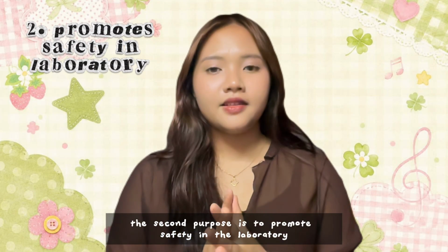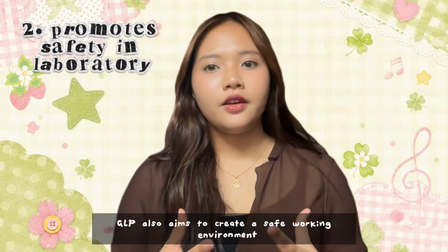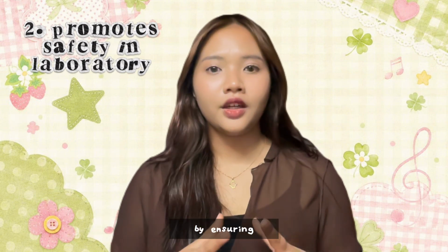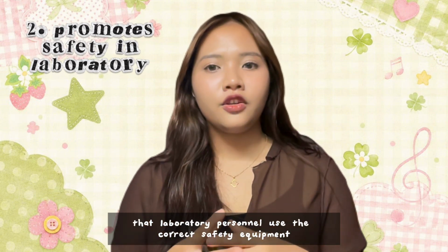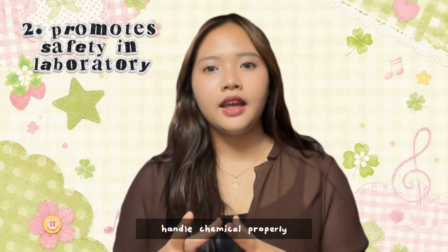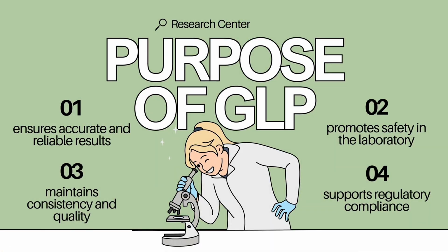The second purpose is to promote safety in the laboratory. GLP also aims to create a safe working environment by ensuring that laboratory personnel use the correct safety equipment, handle chemicals properly, and follow safety protocols to prevent accidents.